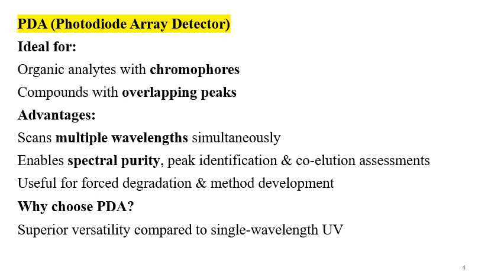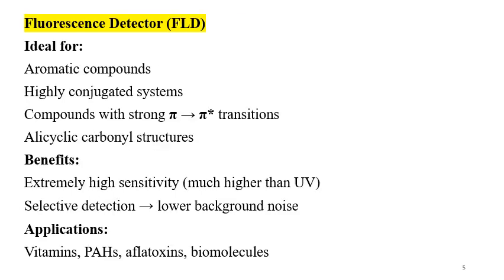Why do you need to choose the PDA detector? The reason is superior versatility compared to single wavelength UV. So the PDA detector can give you the advantage of scanning multiple wavelengths simultaneously.